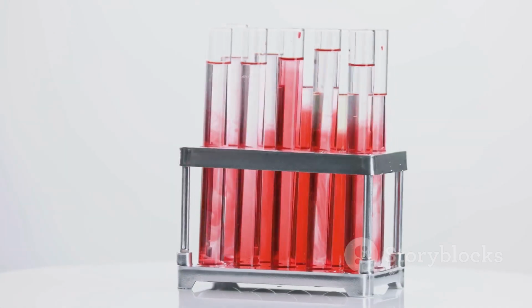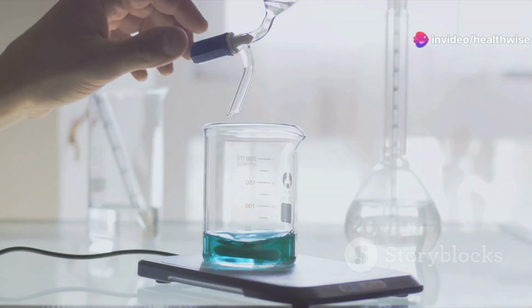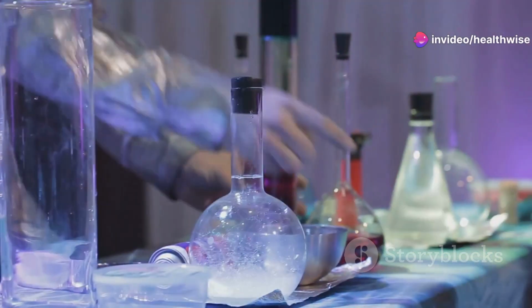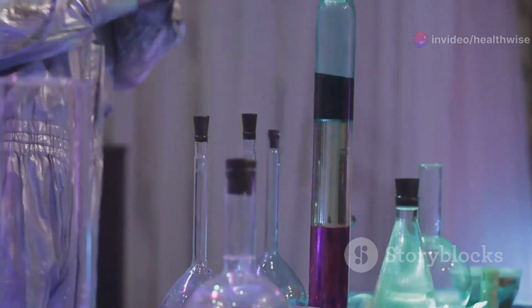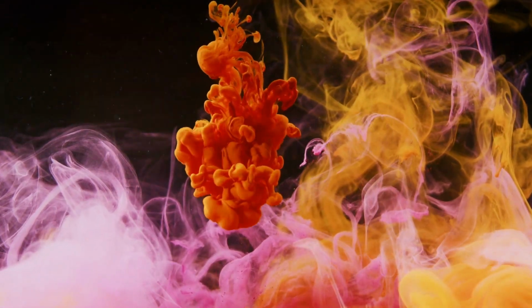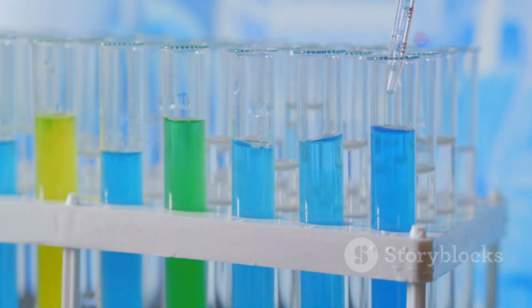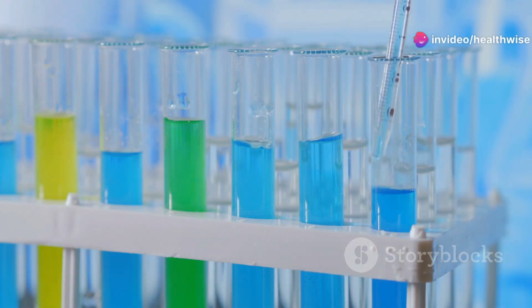First, there's the stationary phase. This is usually a solid and doesn't move. Then we have the mobile phase. This can be a liquid or gas that flows through the stationary phase, carrying the mixture along with it. As the mobile phase moves, different substances in the mixture travel at different speeds. The ones that prefer the mobile phase move faster, while those that stick to the stationary phase move slower.